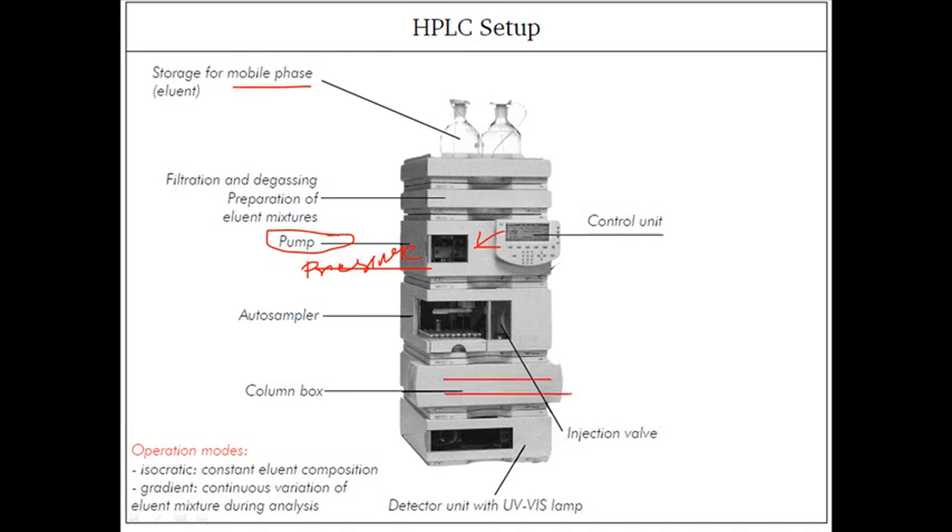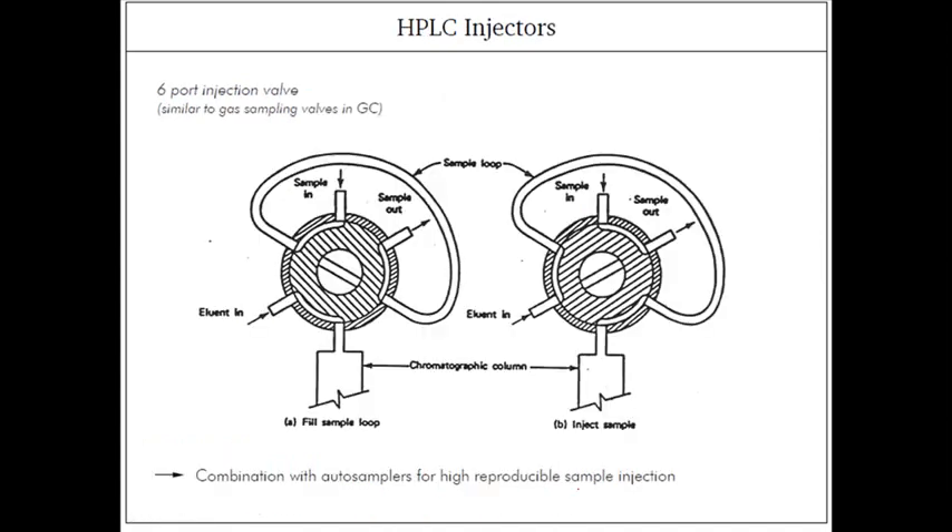The column is placed in this column box where temperature is regulated. We do not need high temperature here, but we need an optimum temperature to carry out these reactions. As we know, in all ionic interactions and polar and non-polar interactions, temperature plays a key role. We also have a detector here, which is a UV-visible lamp in this case.